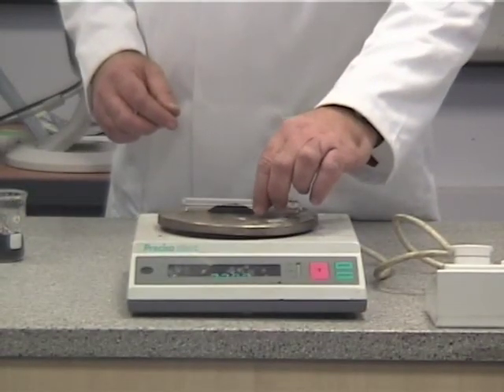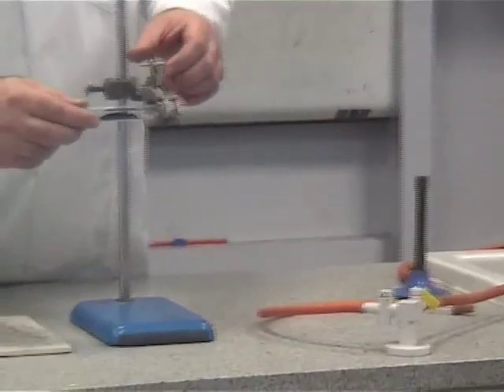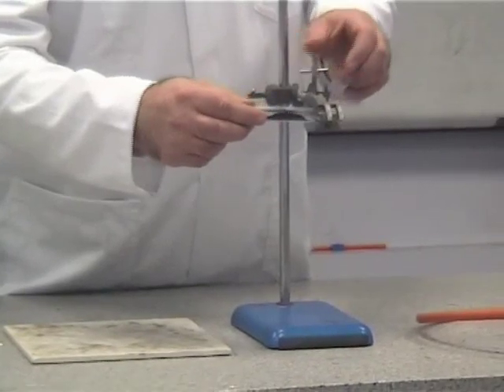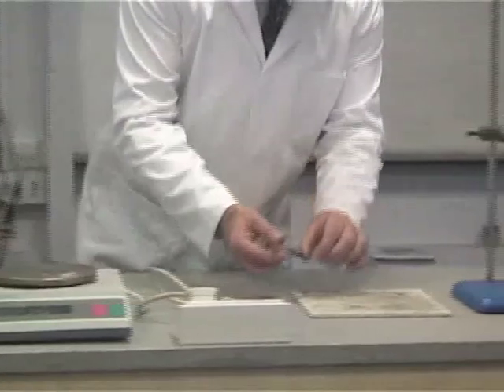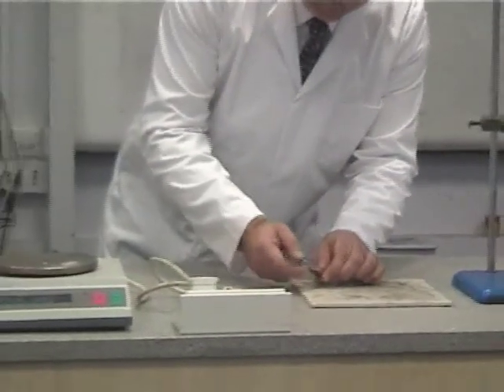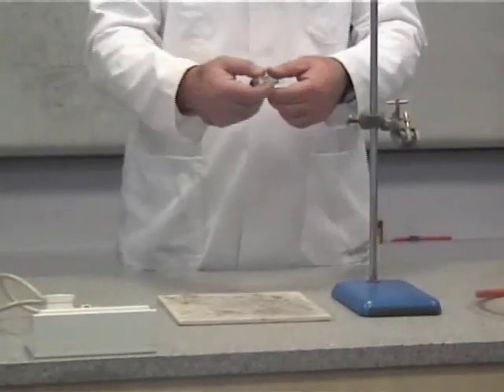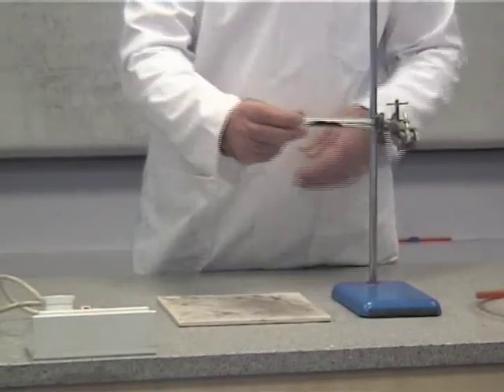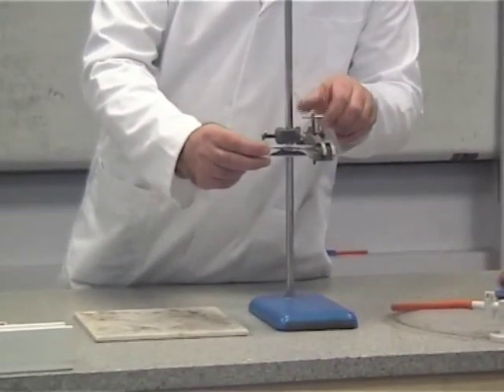You then take the copper oxide in our tube here and we clamp it. And you can just see we need to try and get the copper oxide further down the tube a bit to get it away from the mouth of the clamp stand, and also we need to just keep it away from the hole as well. Clamp it in just like that.